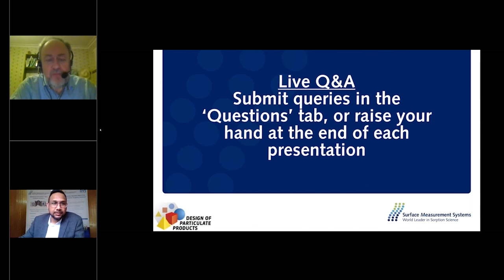If the question's about flow rates in chromatography, there's a good question in. If you want to ask me a good question, it goes like this: are the results I determine using any of the methods you described today affected by the flow rates? And the answer is, in a method like ZLC, they are affected by flow rates, but that's built into the analysis. In the IGC methods, different flow rates should give you the same results, and the same for the second virial coefficients. So if I change the flow rate from 1 cc to 2 cc's or whatever, that should still give me the same net retention volumes. So that wasn't a question I was asked, but a question I'm happy to answer. But if the other question was about NMR, I'm not the person to ask, I don't think.